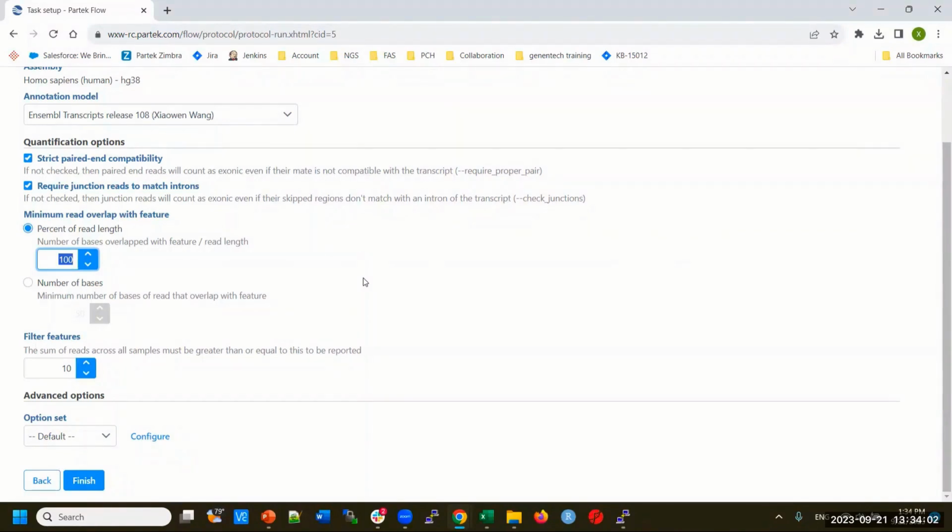Also, after we assign all the reads to each gene in each sample, in a database like Ensembl you might have 50,000 genes. They include all kinds of RNAs, like coding RNA or pseudogenes, so there are a lot of definitions in this database. But probably 10 or 20,000 of those features are going to be zero for your data, and there's no point carrying them over.